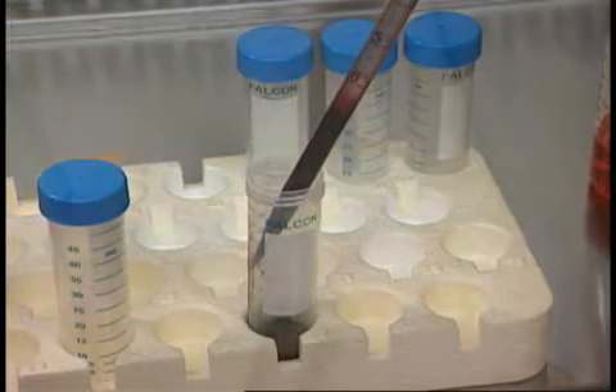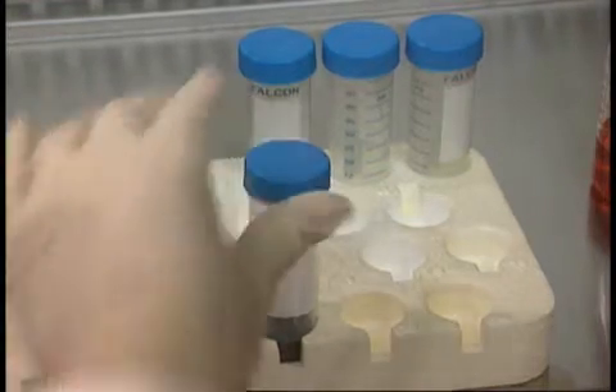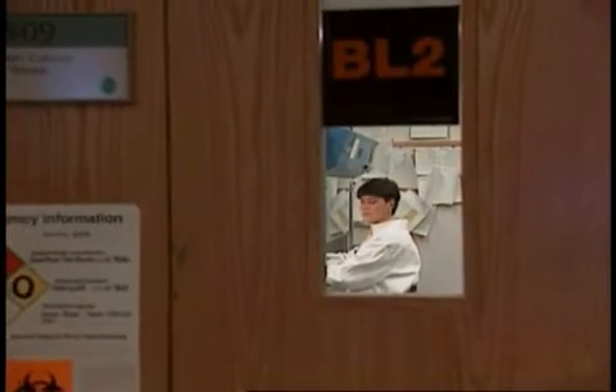Cricket also knows the serious hazard that an exposure to or accidental injection with blood samples represents. For those reasons, she does her work using biosafety level 2 practices and techniques.